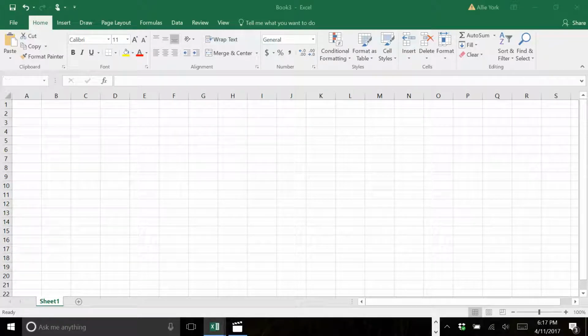Hi everyone, thank you for joining me in this Excel session for how to do the calculations in Excel for experiment 8, determining the pKa of a weak acid. We're going to start by inserting the following information into cell A1.